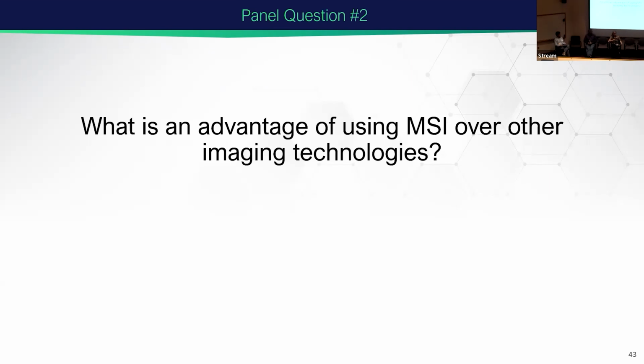So with plants, what's a really cool thing if we think of jasmonic acid stress signaling? We saw the cool lipid images from our talks where a lot of these things are enriched in 18:3. That's alpha-linolenic acid. So why do we care about that? Because a lot of times when we first started publishing these papers on lipidomics imaging, people went, who cares? Structural lipids, they're just in the membrane. They do nothing. We don't care. And it was really hard to get some of those papers out.